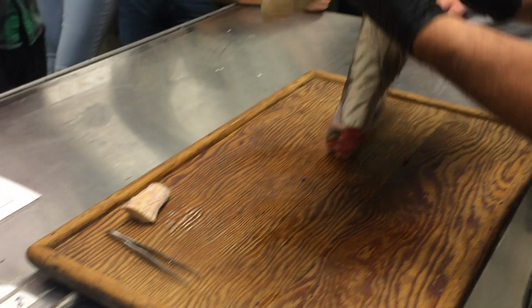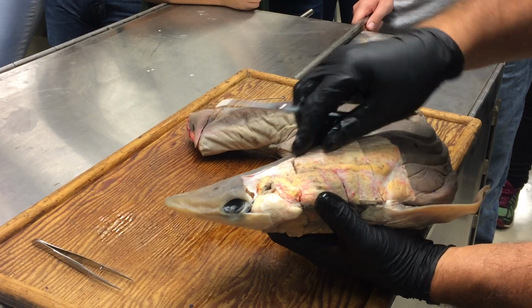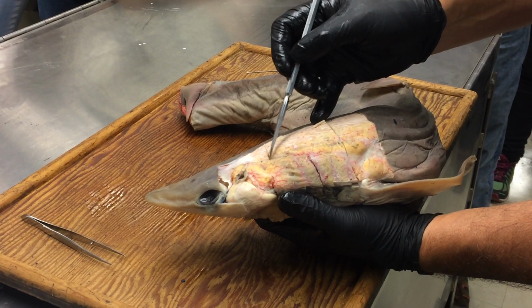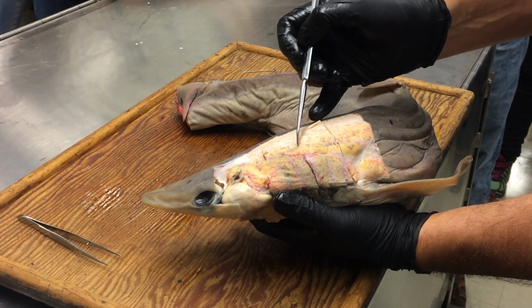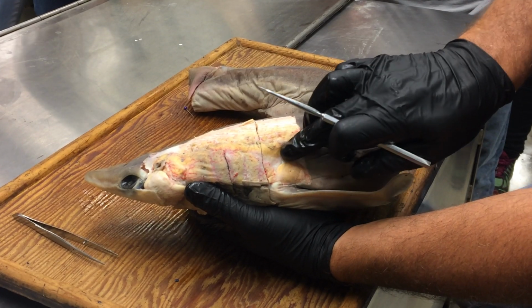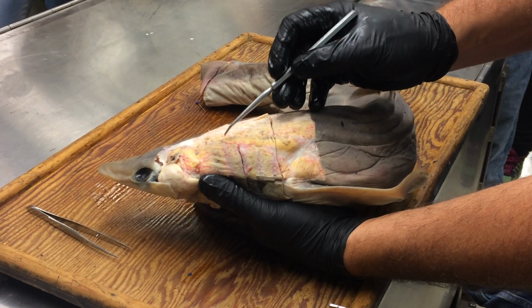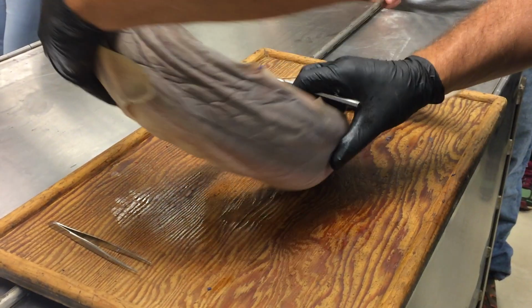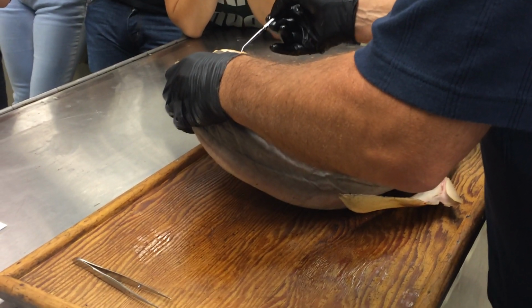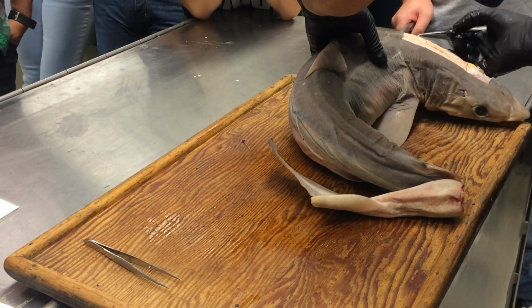What else? If we look dorsally, if I put this chunk back, you can see this muscle that belongs there. There's a kind of triangular shaped muscle that sits right in here. This triangular shaped muscle is hooking onto back here this cartilage of the pectoral girdle, which is the scapular process that's sticking up. And this is called the cucularis muscle. Here's the scapular process sticking up, and this is that little triangular muscle that sits there.